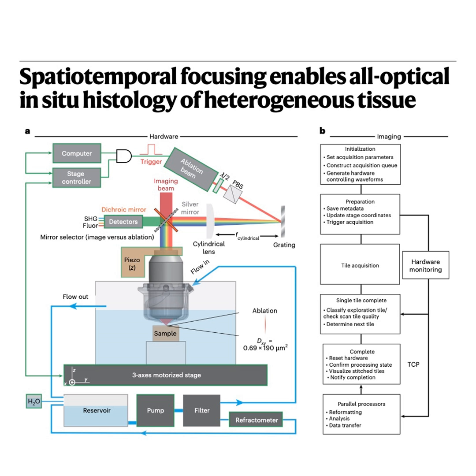Making sure everything is still working correctly and in sync? Yeah. If it detects any instability, like a drop in laser power or a timing mismatch, it can trigger an alert or even automatically pause and attempt to reacquire the image for that section, trying to ensure flawless data acquisition over the entire marathon run.